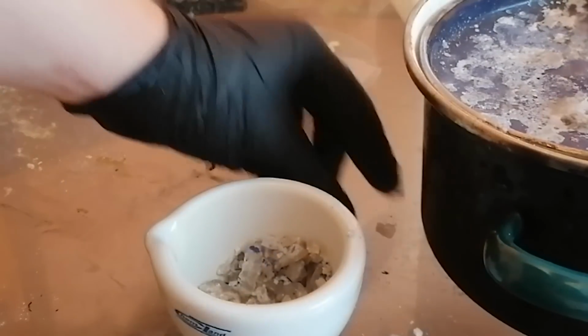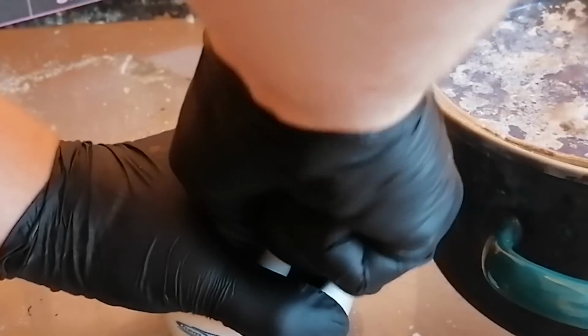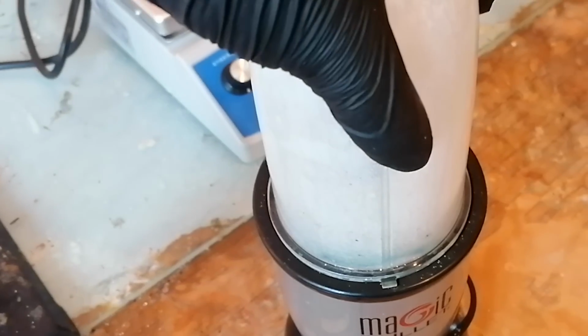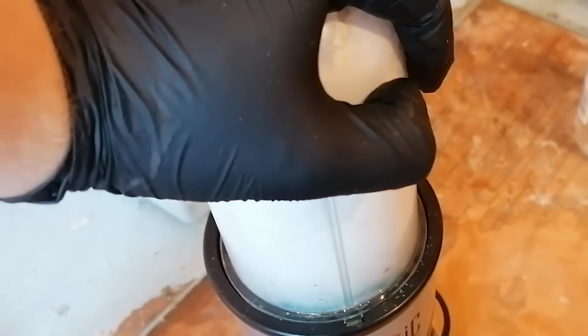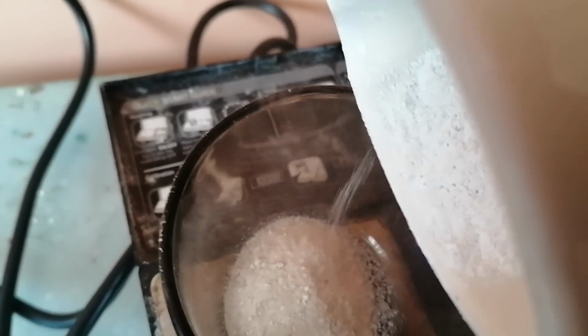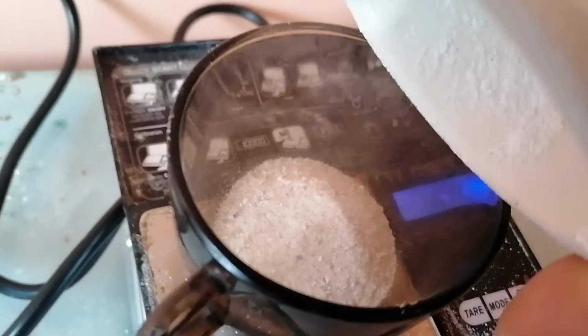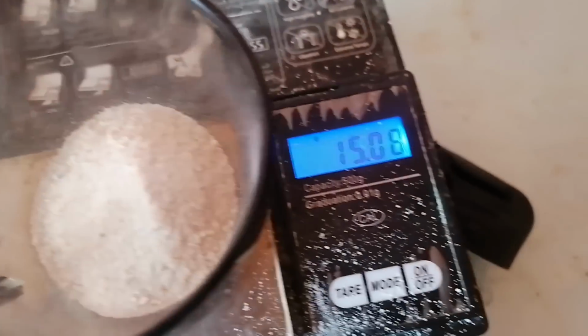Anyway, I've started grinding it using my mortar and pestle. Eventually I said fuck it, I'm not being paid enough by YouTube to grind it by hand, so I've upgraded to a coffee grinder. After finishing, our yield of powdered boron trioxide is 15 grams, which is actually pretty freaking good. Theoretically there should be around 36 grams of boron trioxide waiting in the boric acid in the solution, but it's just way too bothersome to try and recover it.